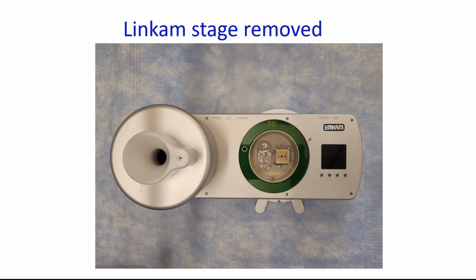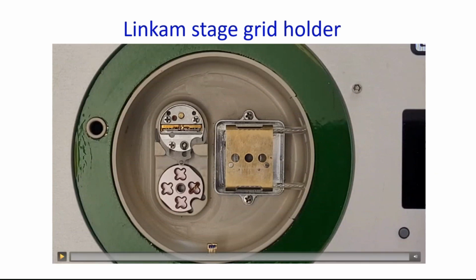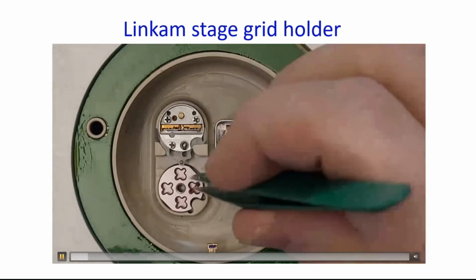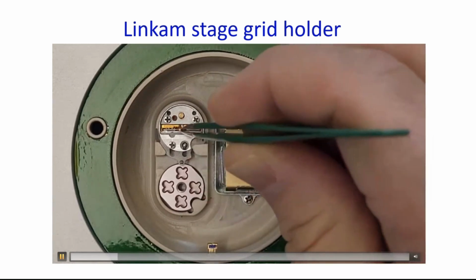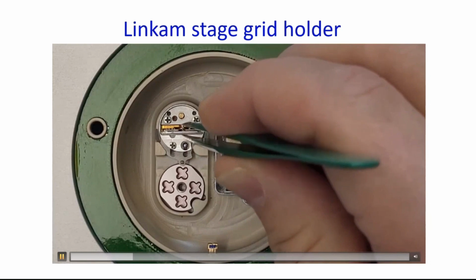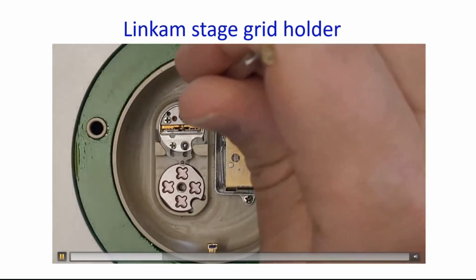So if we look at what this process actually looks like, you have a TEM grid that can be stored in this box. Of course, this would all be under liquid nitrogen conditions. And the grid is loaded into the Linkam holder.